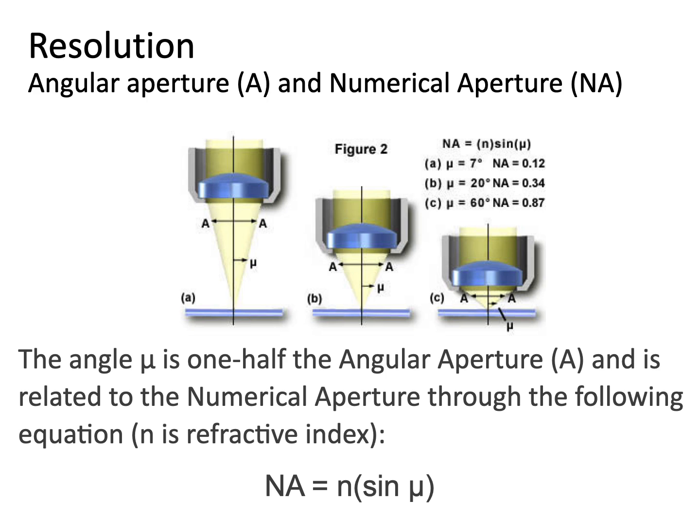Where if you look at A to the left, your book is almost closed and the angle is relatively small. But as you decrease that distance to your sample, the book kind of opens up and that angle becomes higher. That will be related to what we really care about, and that's the numerical aperture, the NA.